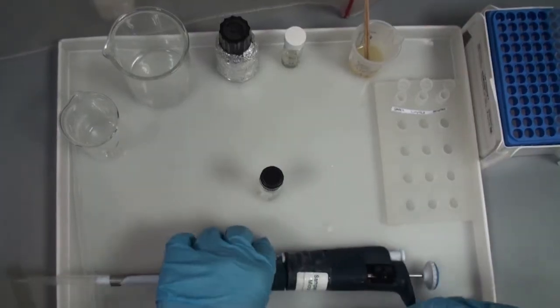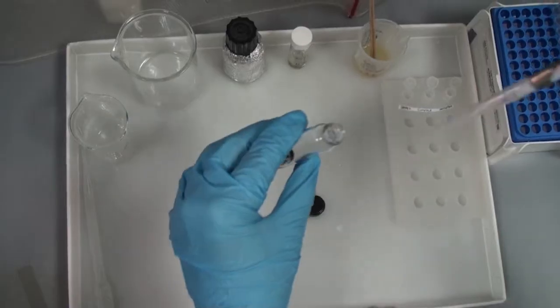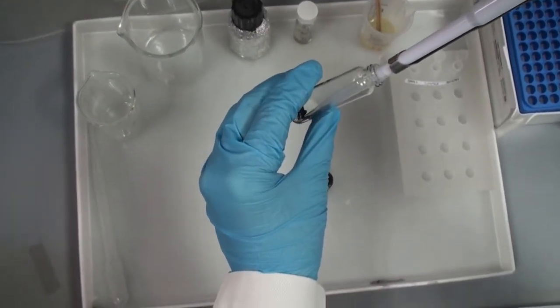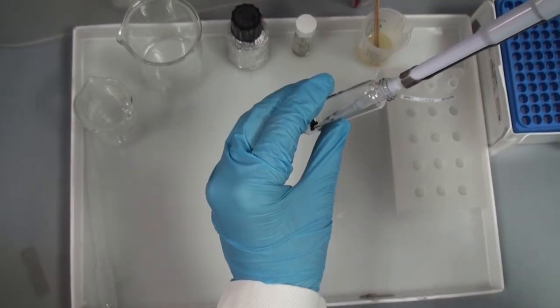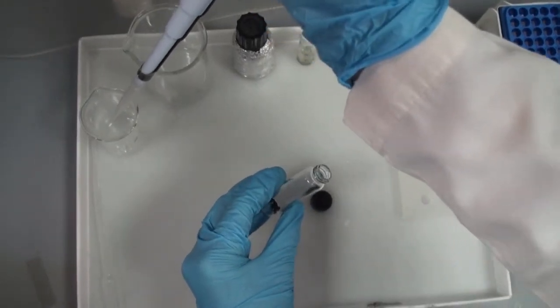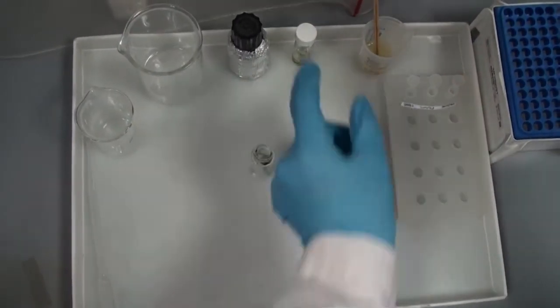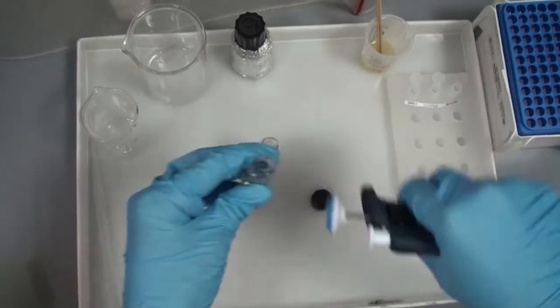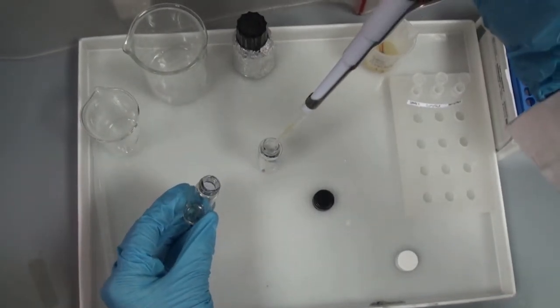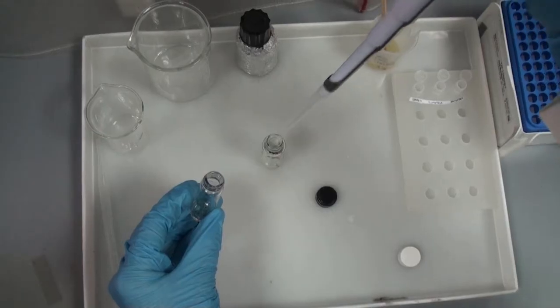Now we will remove the propylene oxide and replace it with a mixture of propylene oxide and resin, one to one. This mixture will be left for one hour. We put it on the sample and leave it for one hour.